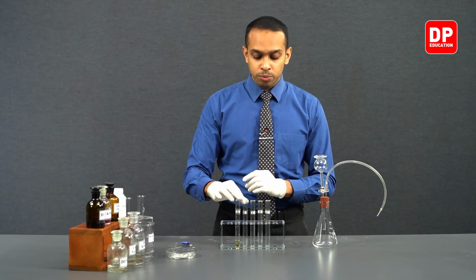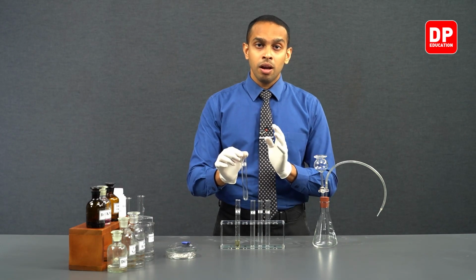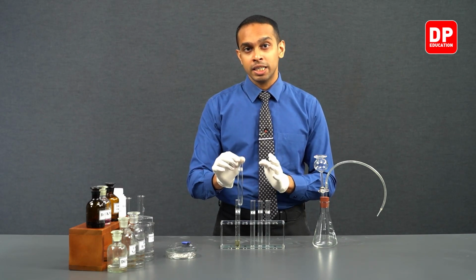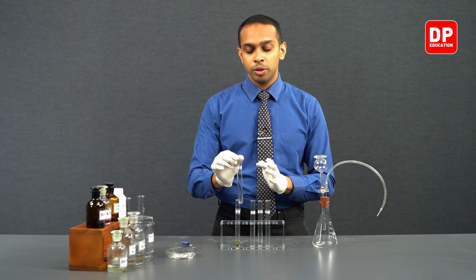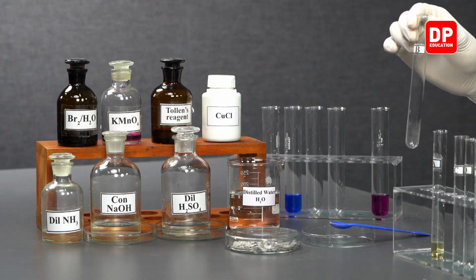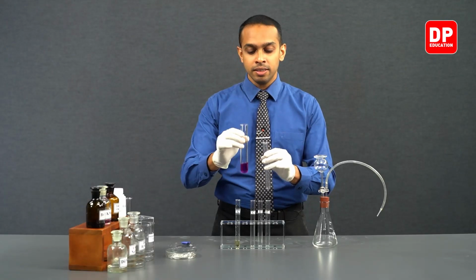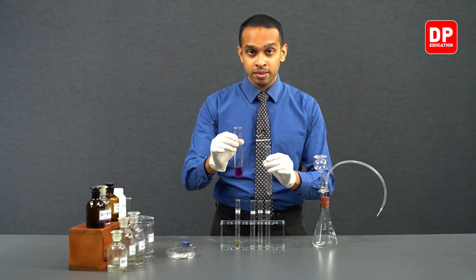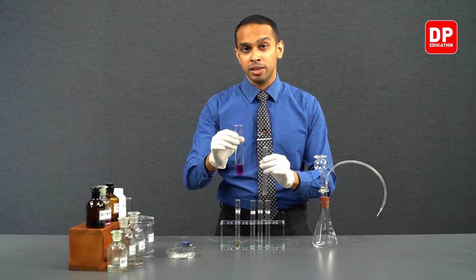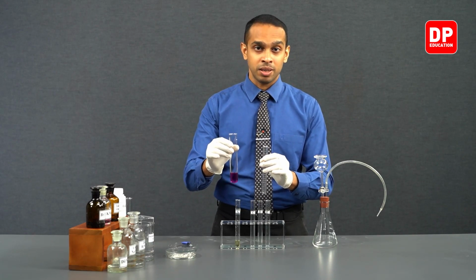And then to our test tube B, we are going to be adding alkaline dilute potassium permanganate solution. We have here a sample of alkaline potassium permanganate solution that we have prepared in the previous part of this particular experiment.